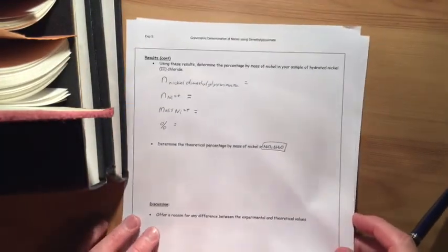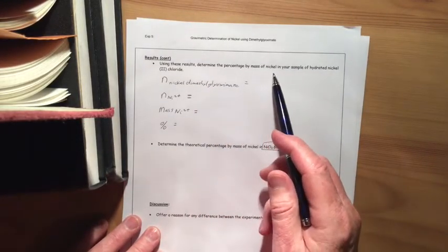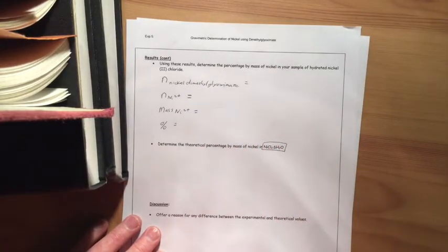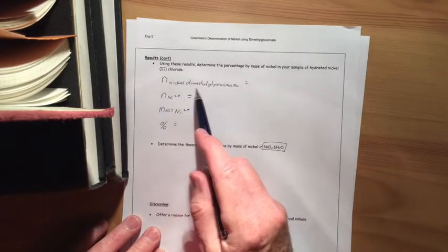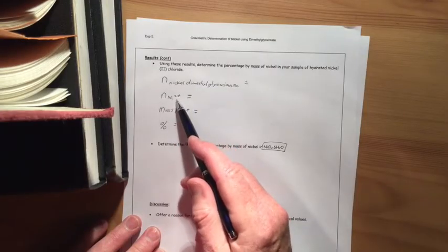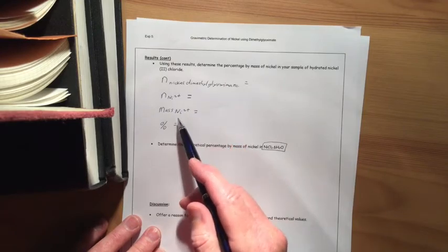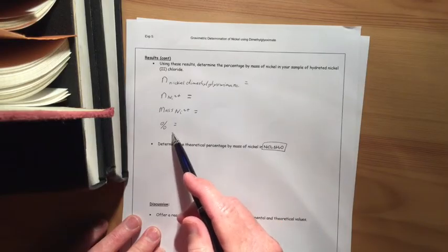Over the page, you're then asked to determine the percentage by mass of nickel in your sample of hydrated nickel chloride using these results. To do that, the first thing you have to do is work out the number of moles you've got of nickel dimethylglyoxime. Then we'll calculate the number of moles of nickel 2+ ions, which will be the same because there's 1 mole of nickel 2+ ions in 1 mole of nickel dimethylglyoxime. So thereafter work out the mass of nickel ions in your complex and hence the percentage of nickel in your original sample.